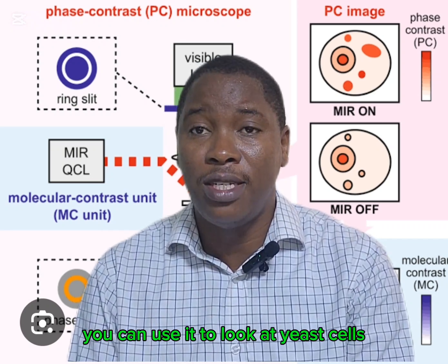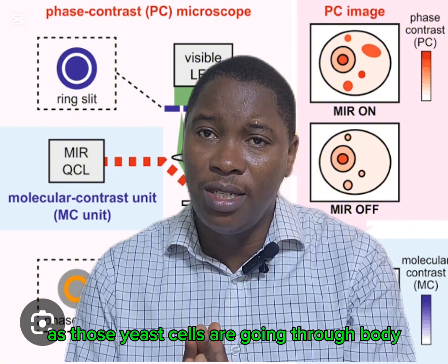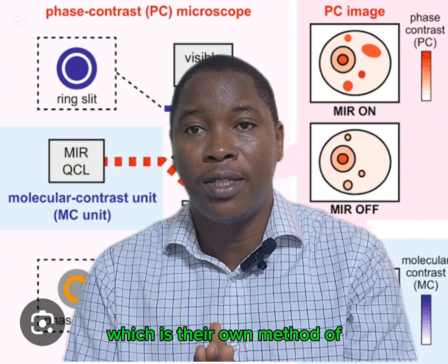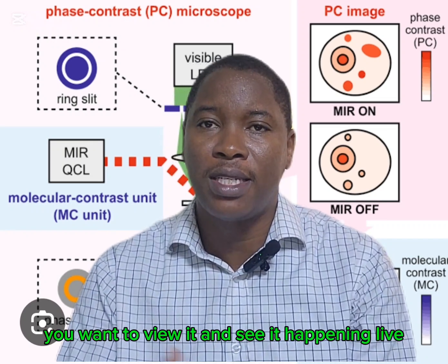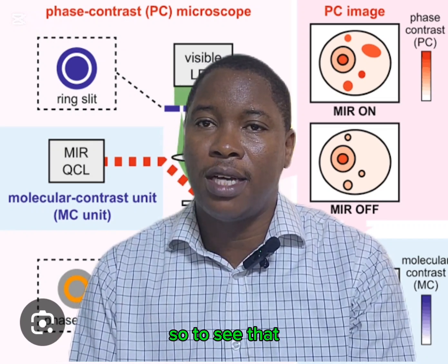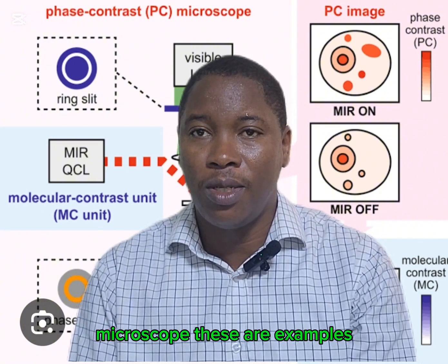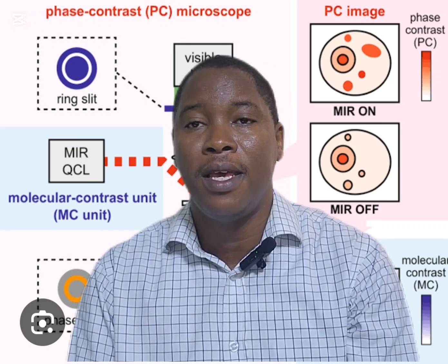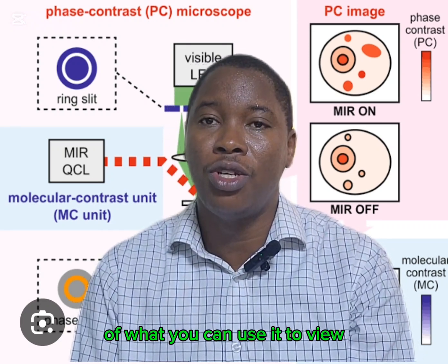You can use it to look at yeast cells, as those yeast cells are going through budding, which is one of their methods of reproduction. You want to view it and see it happening live. So to see that, you have to apply the use of the phase contrast microscopy. These are examples, and I've also given you an example before of what you can use it to view.